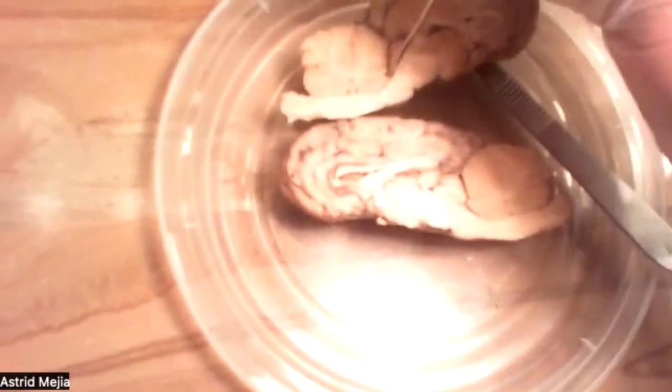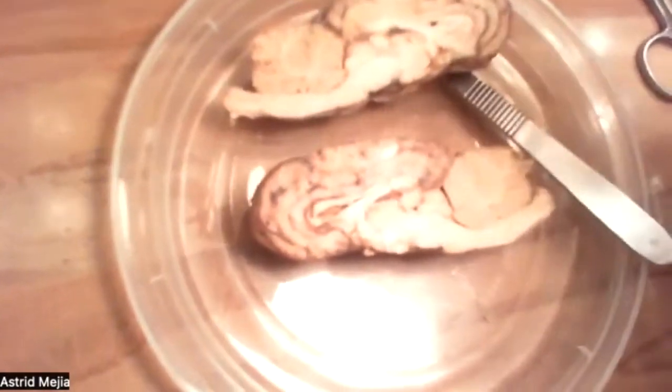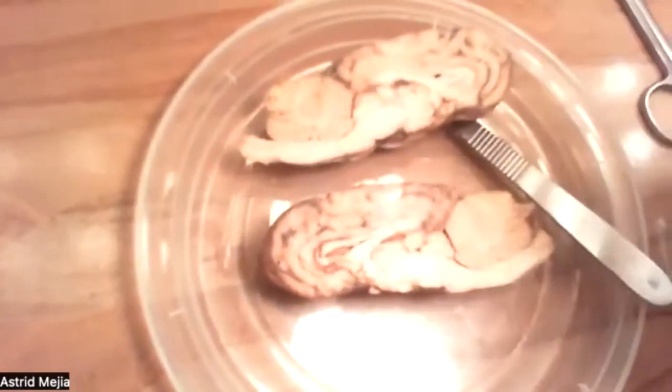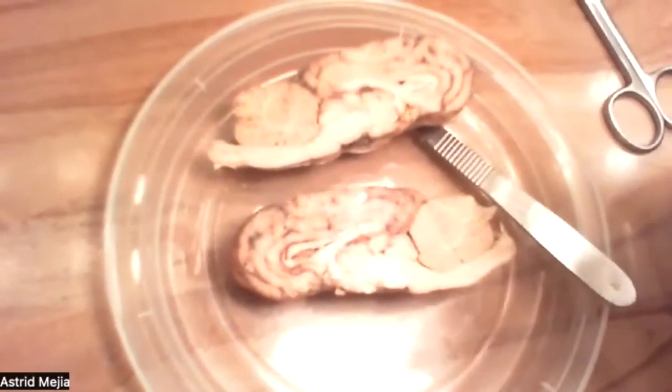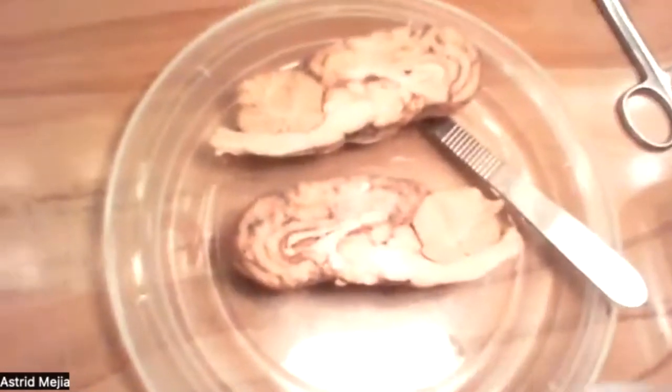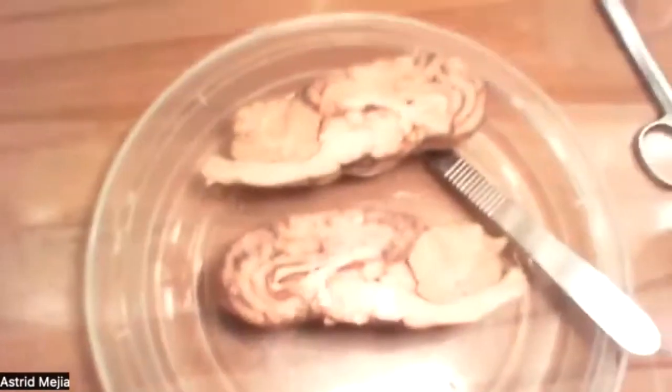That little gap right there is known as the fourth ventricle. And this protects the human brain from trauma, and it helps form the central canal. I think that's how you pronounce it. Sorry if I pronounced it wrong.